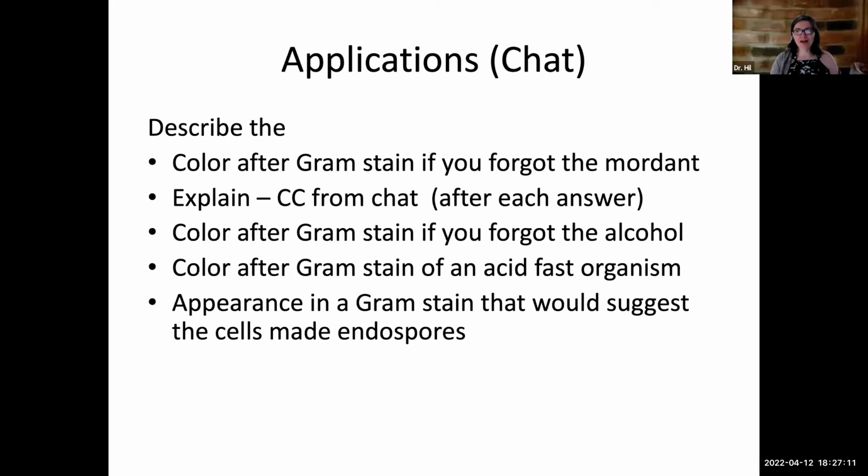Yeah. Endospores are at least initially generated internally inside the cell. And because that's the case and they are not easily stained, then if there's an endospore inside of a cell and you do a Gram stain, the most likely thing you're going to see is a clear hole in the middle of the cell that didn't receive the Gram reagents. And that might make you think, either I'm bad at Gram staining today, physics doesn't work, or maybe there's endospores.